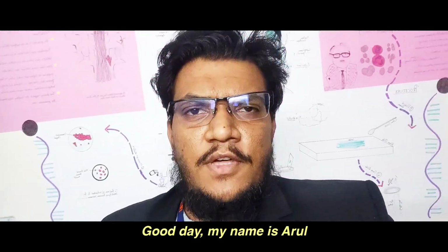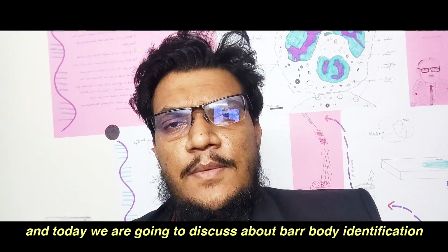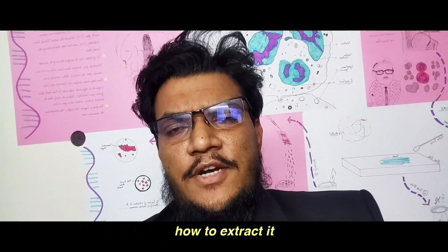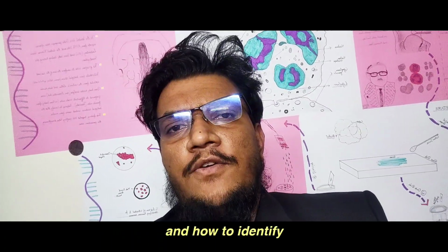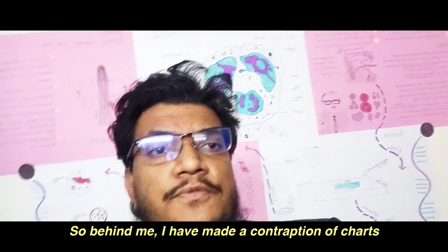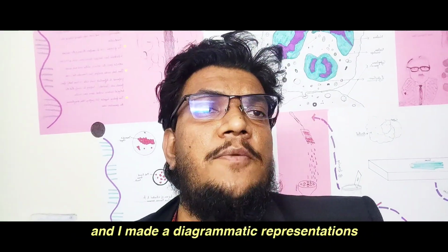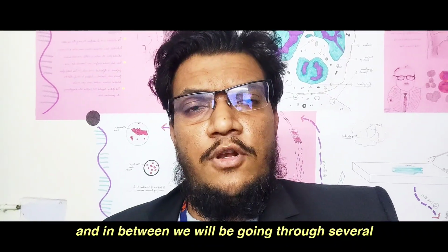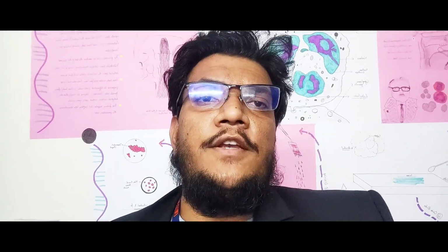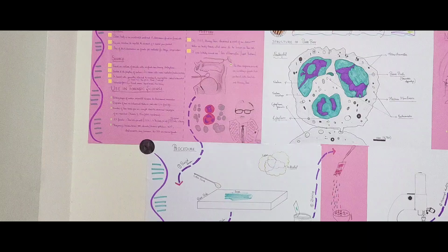Good day, my name is Arul and today we are going to discuss Barr body identification, the experiment on how to extract it, how to identify and separate it, and its significance in forensic science. Behind me I have made a contraption of charts and diagrammatic representations, and in between we will be going through several animated videos as well as case studies at the end. Let's move into it.